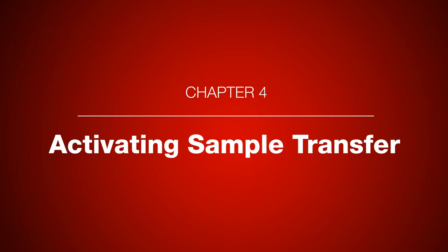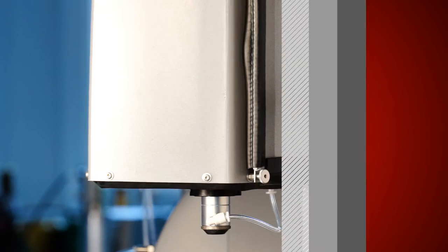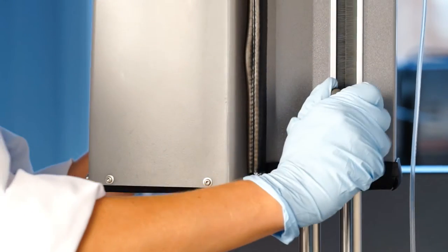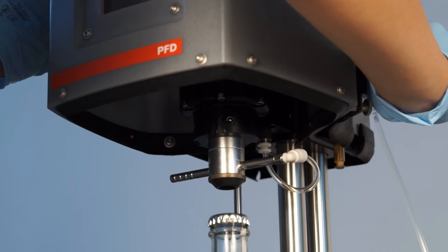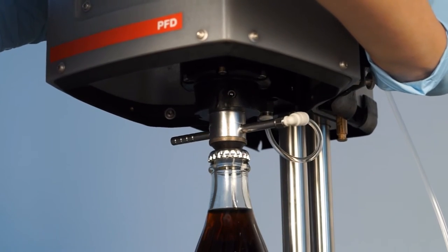For proper sample transfer, the filling device needs to be adapted according to the sample container. For cans and glass bottles, adjust the height so that the ring disappears under the piercing head.